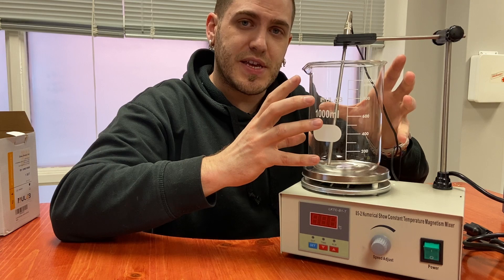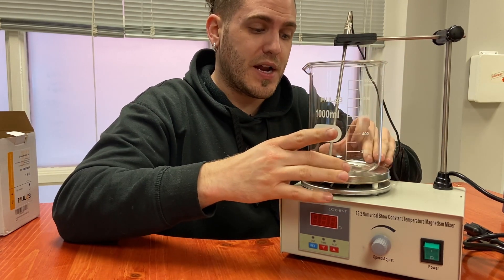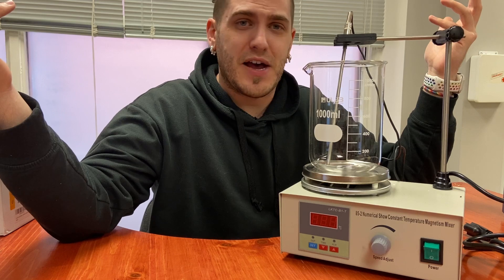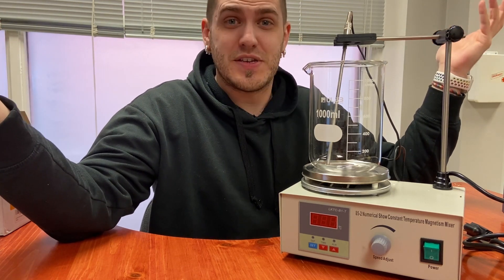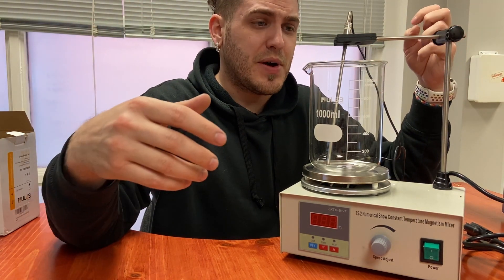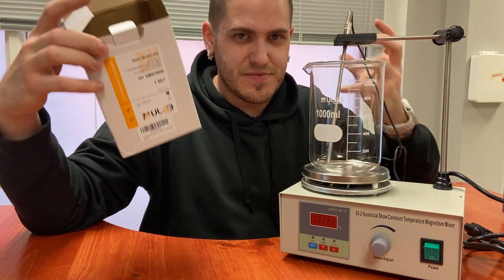These beakers, by the way, are borosilicate, which means they are — I believe that's like a harder type of glass, like Pyrex basically. It means that I'm not going to be scared when I turn the heater on and it heats up the glass with the solution directly. I had some other beakers that I got at like Michael's Craft on a Halloween sale for 10 bucks — those ones are probably just going to be my rinse beakers, just for water purposes. But I went and got the specific lab-grade borosilicate ones because I wanted to do everything correctly.